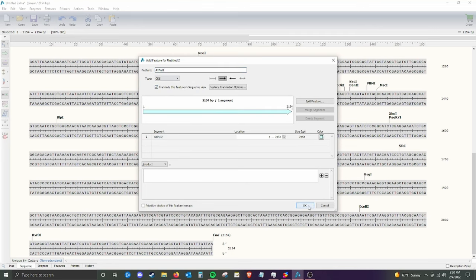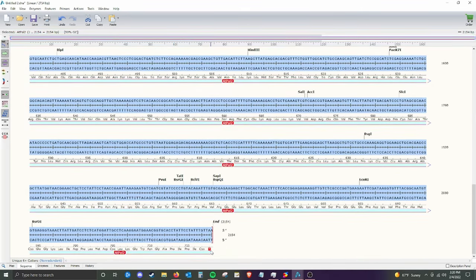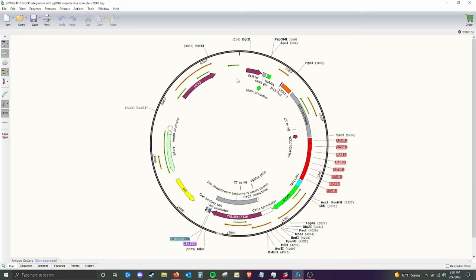It's important to see that there's a start codon, ATG, which encodes methionine, and that there's a stop codon — in this case, TAA. So here's our whole gene. Now we need to actually put this ATPAL2 gene into the plasmid that will help us integrate it into Yarrowia. This is the plasmid I was talking about on the whiteboard. You can see the GFP gene right here — this is the gene we need to get rid of and replace with our ATPAL2 gene.